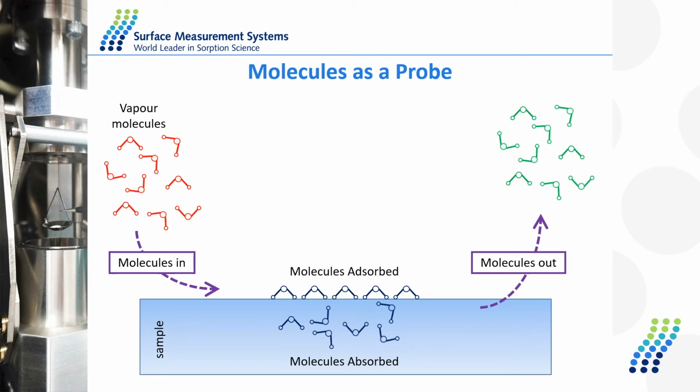Now, what I'm going to do in the next couple of slides is focus specifically on the definition and the concept of adsorption and absorption, because these two main concepts are going to be used throughout the presentation to analyze the structure of different types of material. Let's start from adsorption.